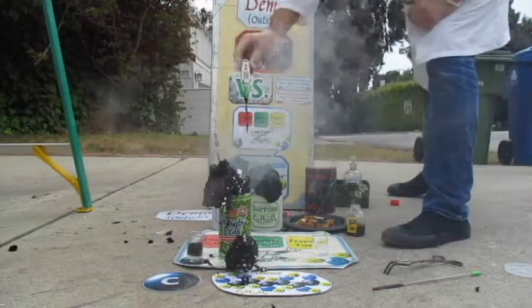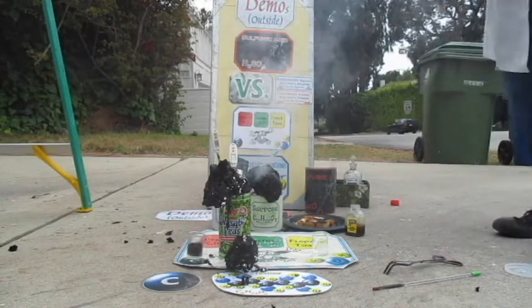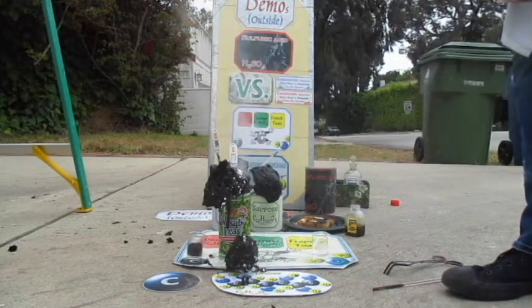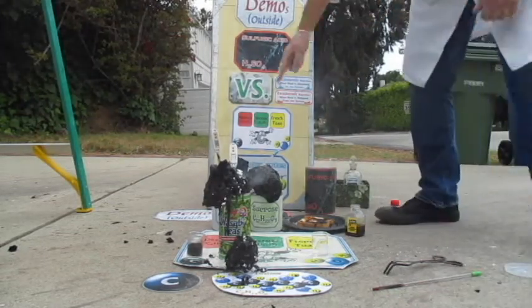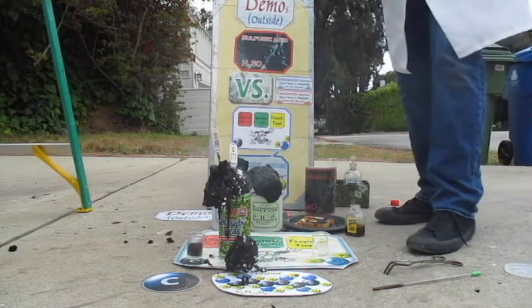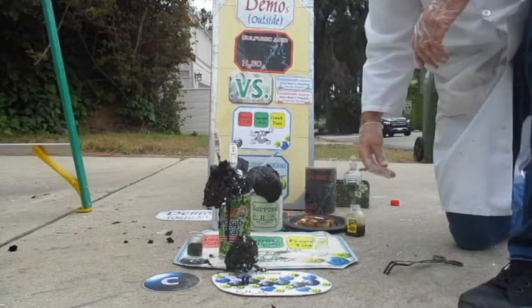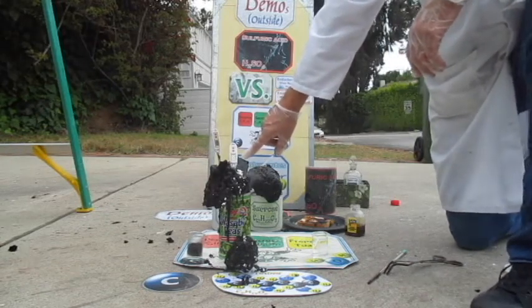Let's see what the temperature is here. It's going up, 117, 119. It's in the 120s. So this might not have been quite as high a temperature as this one was, which is still showing 140, or maybe it's still getting there. But it happened much faster. Why? Because it's much smaller grain sizes. And again, it would go off this thermometer. That's why we have the digital thermometers. Oh, now it's in the 130s.